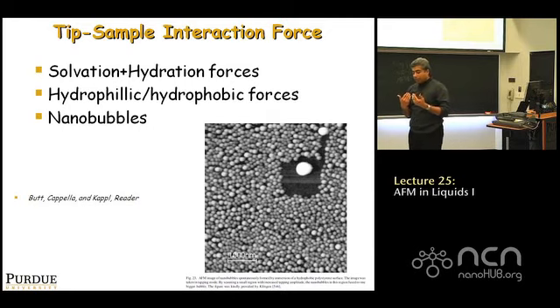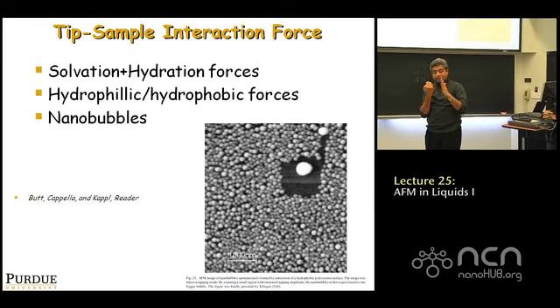what we're talking about here is the fact that you've got a tip and you've got a sample. At the end of the day, when the tip comes and contacts the sample, there are interaction forces, of course, but there has to be an interaction force that has to do with the force required to clear the water out of the interface. There's water on the tip, there's water on the sample, there's water in between. When you make contact, you've had to do some extra work to physically move the water out, right?